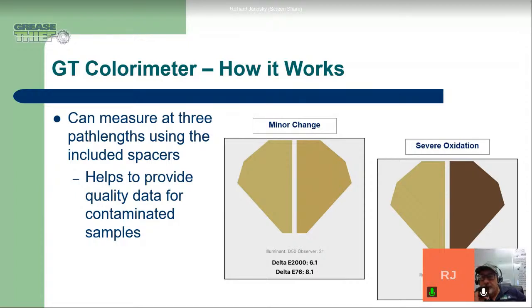Yeah. And I know too, you mentioned consistency. The other one that is helpful too for especially robots is the ruler test for antioxidants. And we find that that's been extremely helpful in being able to prove that sometimes we have a grease that is very old, and for example, not quite as dark as that oxidized sample, but we're able to test it and prove that this grease is just dark based on color. It's got antioxidants remaining, it's got low wear, it's got great consistency, and this grease will perform as intended in service. Its color is just different. So that's also an example of sometimes the color changing might not be a bad thing.